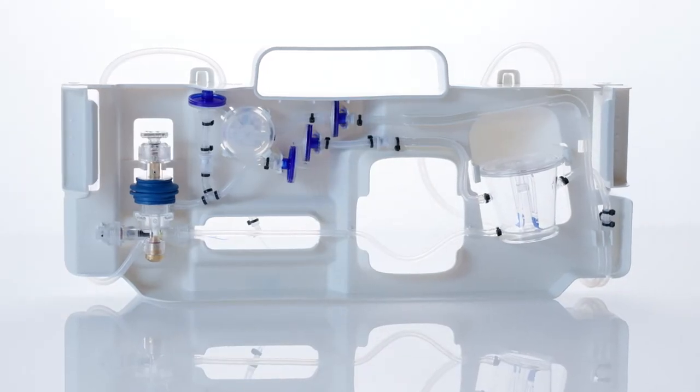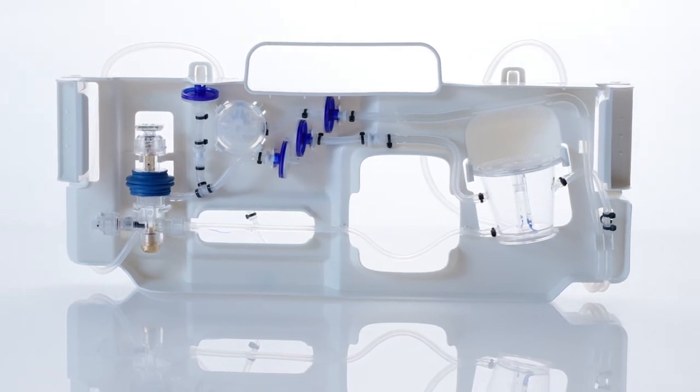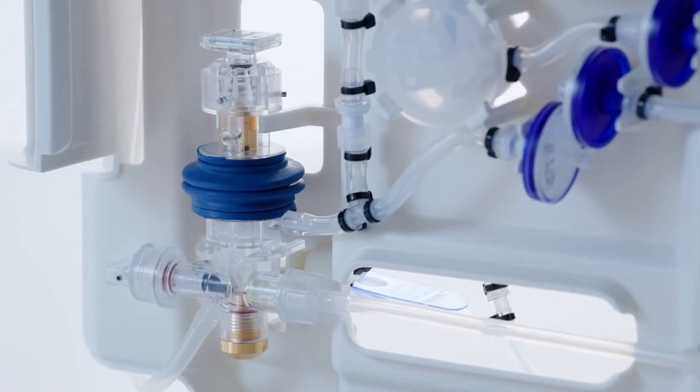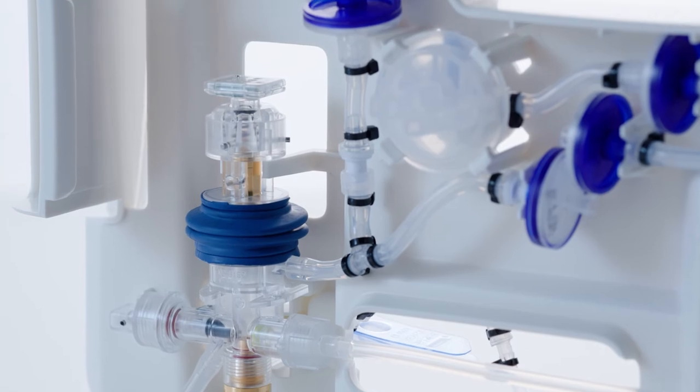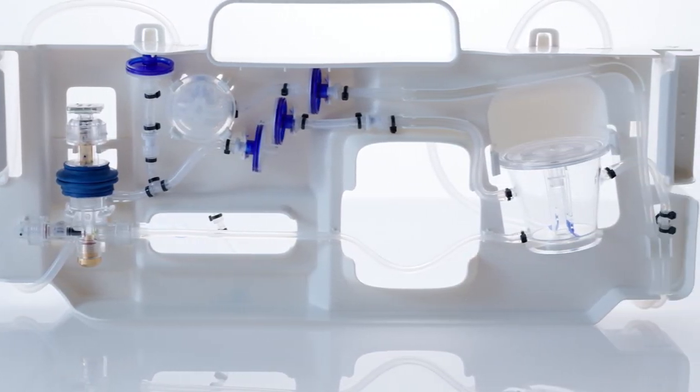The multi-shot format uses cell input and output bags, a mixing cup, and the same type of electroporation chamber as the single-shot format, to process up to 2.5 billion cells in a sample volume between 5 and 25 milliliters.